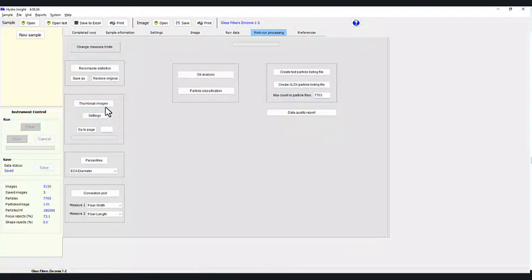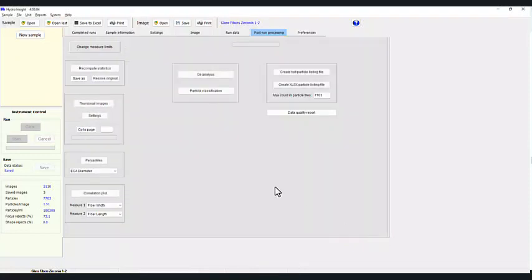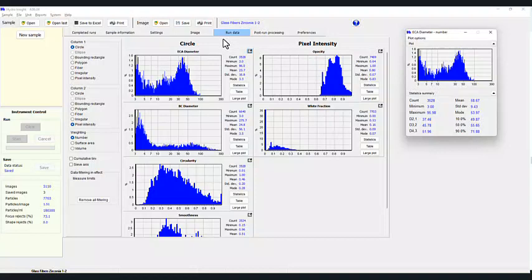So one of the things we can normally do is go in and look at just the thumbnail images of all the samples, but that tends to be a bit overwhelming, searching through thousands and thousands of thumbnails. We tend to use thumbnail images as a final confirmation. So, for example, what we were just doing, where we said, okay, only show me the particles from, let's say, 30 to 100 or 50 to 100, and I can see what percentage there is, but then also go ahead and show me those thumbnails.